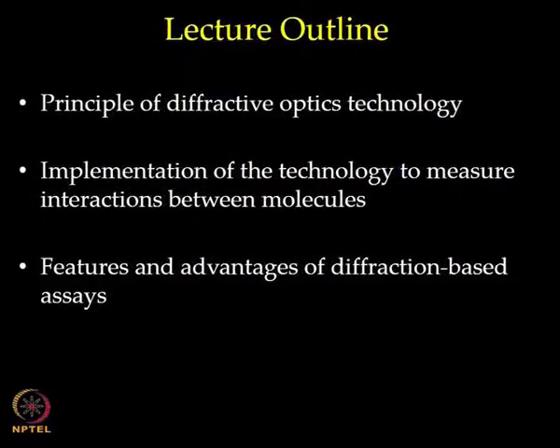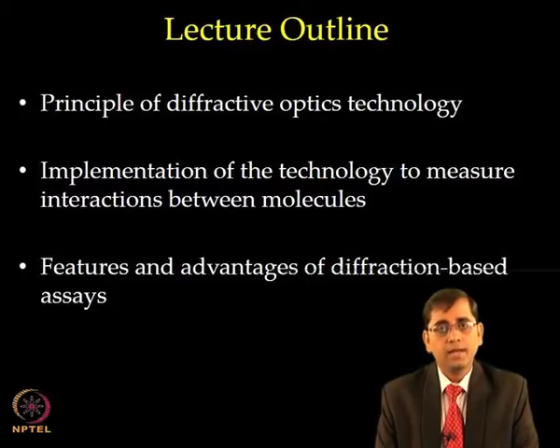In our previous lectures, we have discussed various label-free methods, including surface plasmon resonance based optical biosensors to measure biomolecular interactions, especially protein-protein interactions. Today with Dr. Cynthia Go, we will discuss diffraction-based biosensors, which her lab is actively working on.